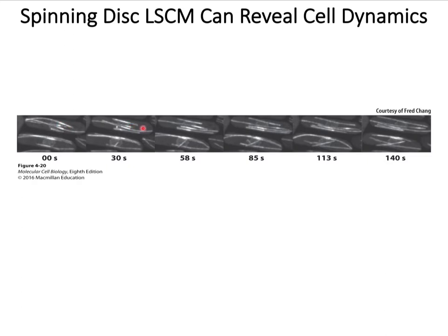At 30 seconds, there is a small white structure formed on the upper side, and you can see that this microtubule is elongated over time. On the other hand, in the middle portion of the bottom cell, there is a tiny spicule-like projection that also grew rapidly and elongated over time.